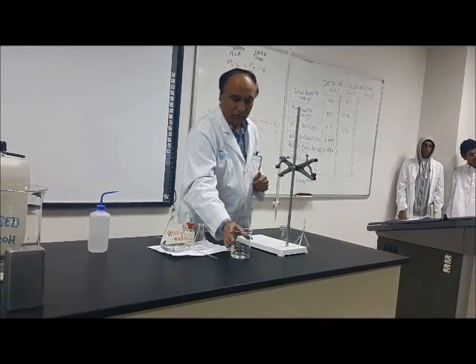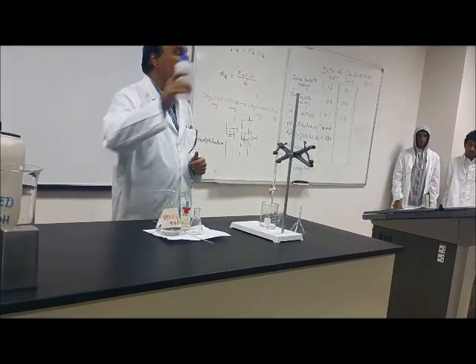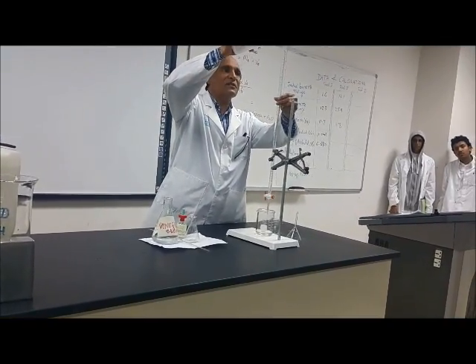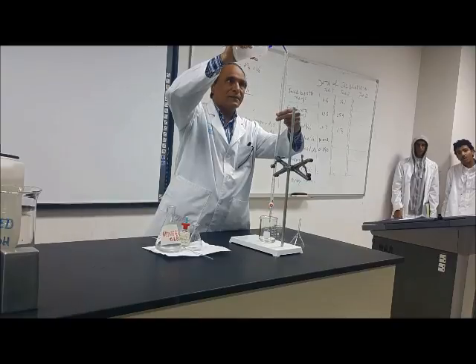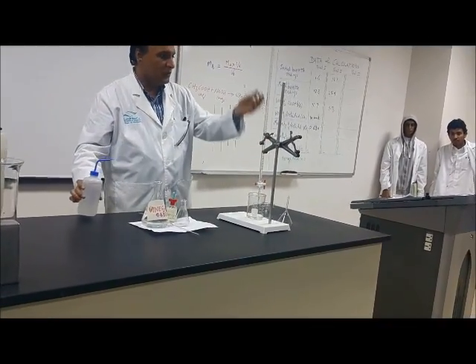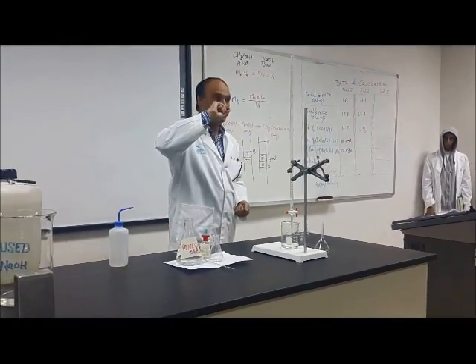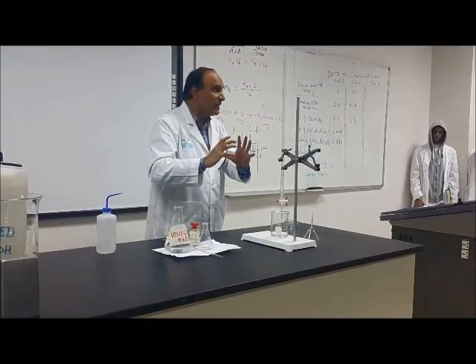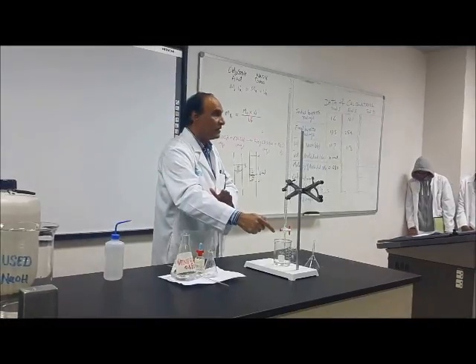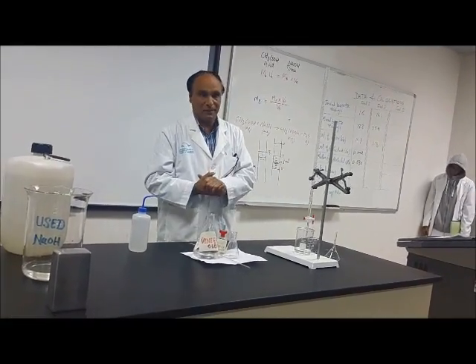Yes. How can we release this? Put the washing one over here, and wash a little bit with distilled water. Take this one and put some distilled water like this. This much amount. It will remove all the sodium hydroxide and your burette will not be blocked. Otherwise, it will react with the carbon dioxide in the air and form sodium carbonate, which is solid, and the next student will find difficulty doing the experiment.